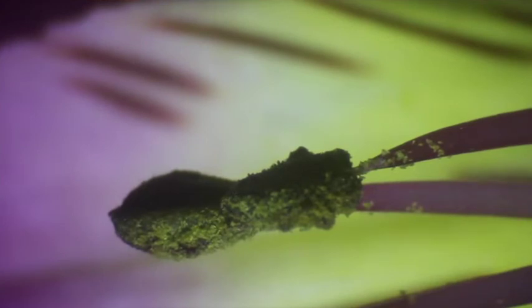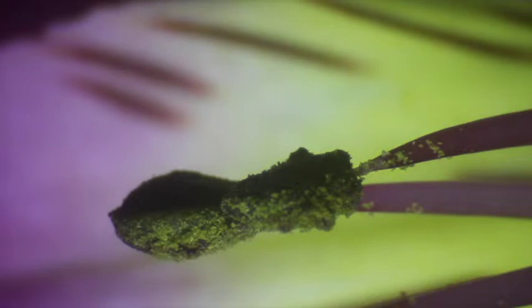Okay, so here's our Ostromeria underneath the dissecting scope. And again, we're looking for spores, sporophytes, gametophytes, gametes. So these are both stamen. The stamen then is the male reproductive part in the flower. Inside the stamen then, right, the flower itself is part of the sporophyte, so the flower is diploid.